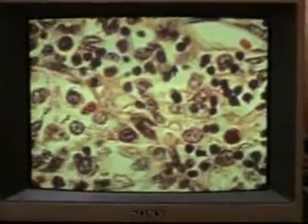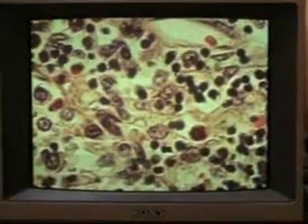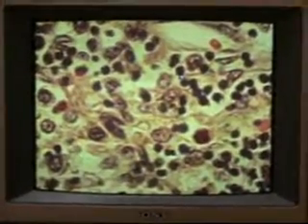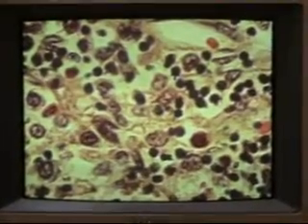So there may be thymic nurse cells. There was a quite long period of time when these were described by pathologists, and there was a big debate about whether the lymphocytes are inside the cytoplasm or just surrounded by these cells and attached to them.